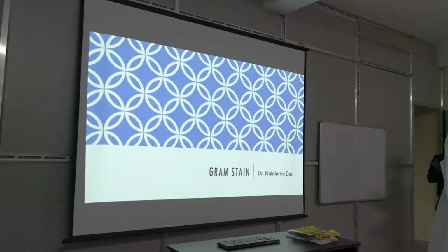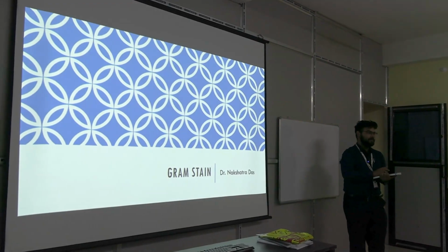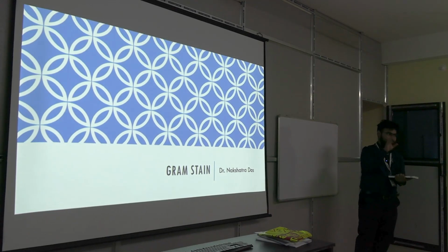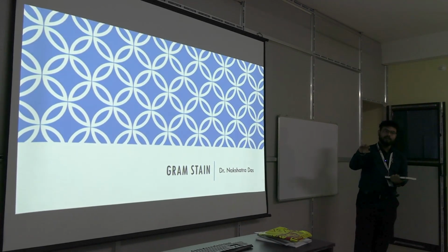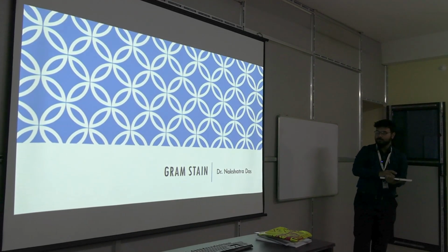Today we will learn gram staining, and you will learn it by yourself. We will not spoon feed you, like do this, do that step. The steps will be shown here and you will have to perform it on your own. We have told you how staining is done and what the different types of stains are. Now gram stain, the differential stain, you will do it for yourself. Is it clear?